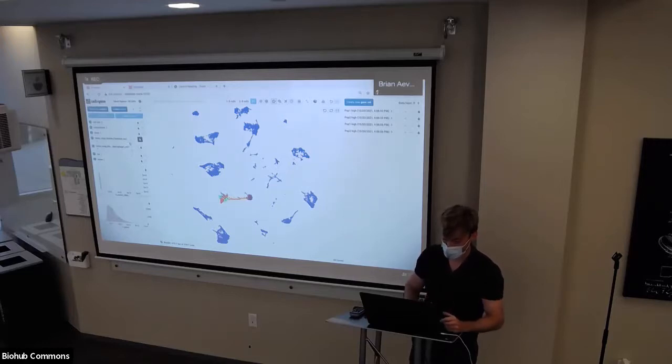So this is where another handy feature I've added comes in, called fuse labels. You check the ones that you want to fuse. Here I want to fuse this guy with this guy, and eventually with all the other guys that I've subclustered, or manually annotated in a subview, something like that. You click fuse labels, and then you have a hashed name. It was too complicated and the name would get too long to fuse these names, so I just hashed it out to be a unique name that you can then relabel.